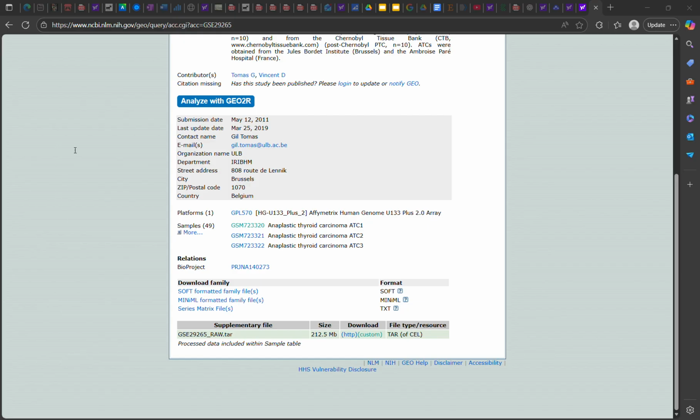It's actually making row names into columns and just making the whole table a little easier to understand. So we just run that, and let's see if that worked. Oh, nope, did not work. Let me see if I can try this again. For some reason, sometimes it does this. I'm not really sure why. Yep, there we go, all set. Okay, so that should have worked.